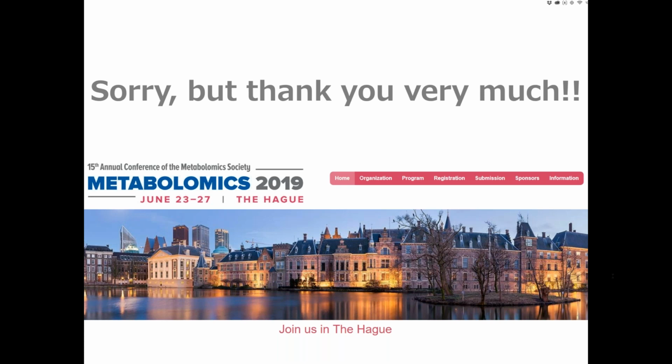Okay, and another question, again for MS-DIAL, from Yassine Al-Abedi. He asks, how is MS-DIAL dealing with chimeric spectra, that is, two or more precursor ions in one MS2 scan? And again, you mean how MS-DIAL deals with what? Chimeric spectra, that is, two or more precursor ions in one scan.